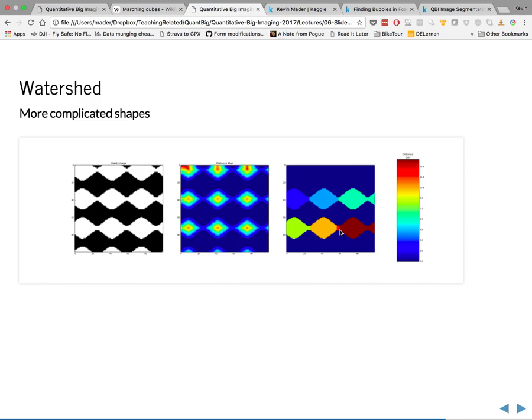You assign it to the larger neighbor, or to the neighbor that's closest, or where they have the largest interface between them, or any number of other rules that make sense for the samples you're looking at. So having something that divides your objects up too much isn't a problem. It's only a problem if you haven't divided them up enough, because coming up with better rules to cut samples can be very tricky.